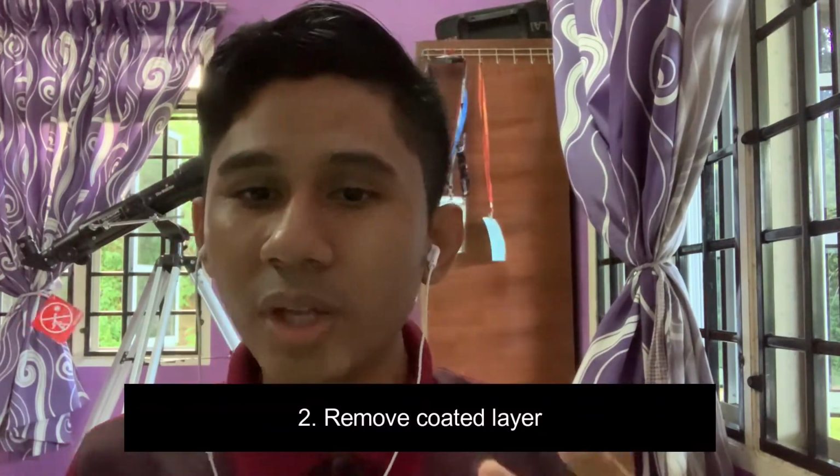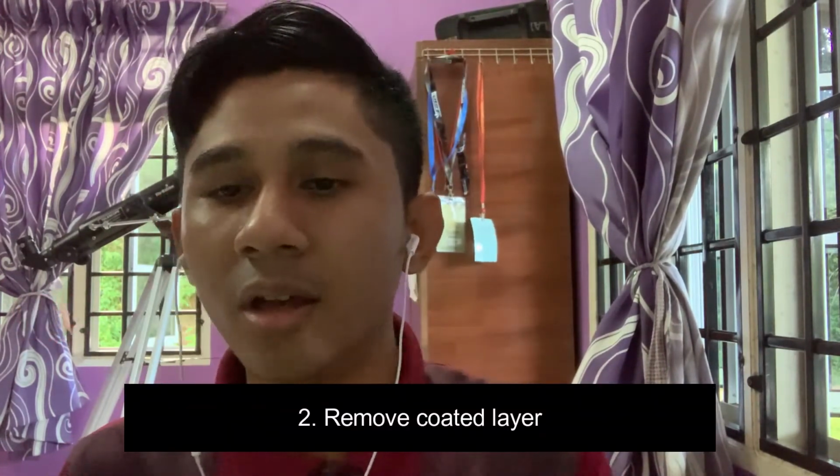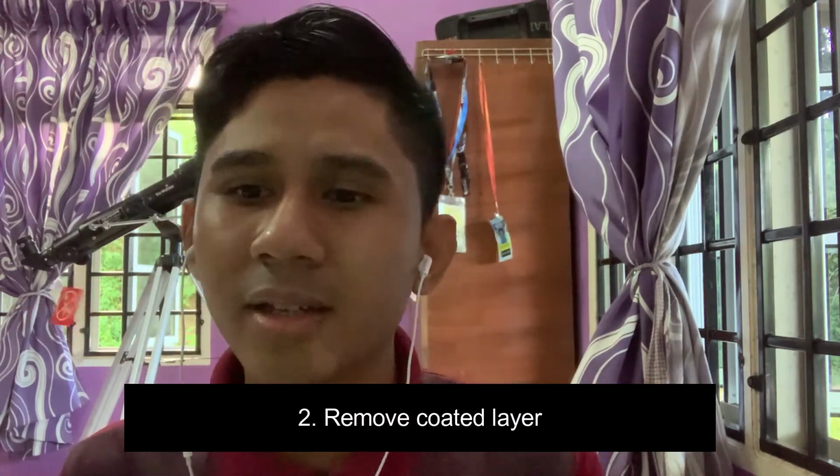So if the sample surface is coated, we need to remove the coated layer by simply using mechanical rubbing with an organic solvent to polish the sample and remove the coated part.